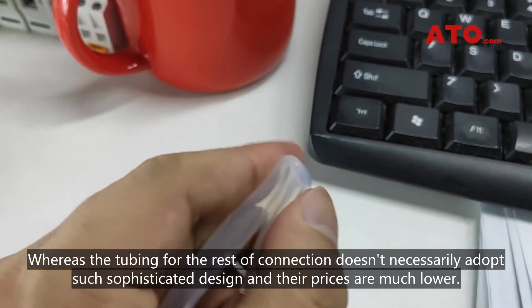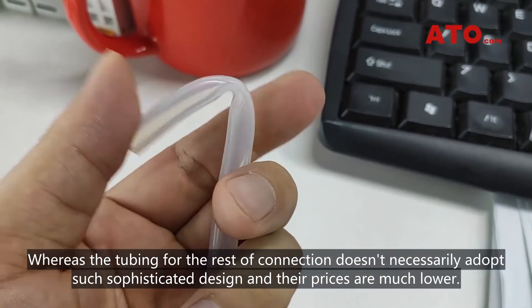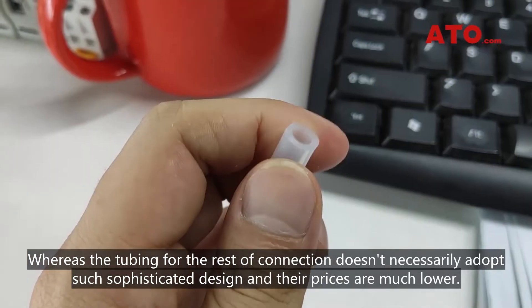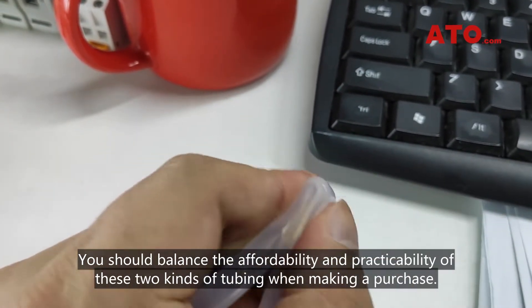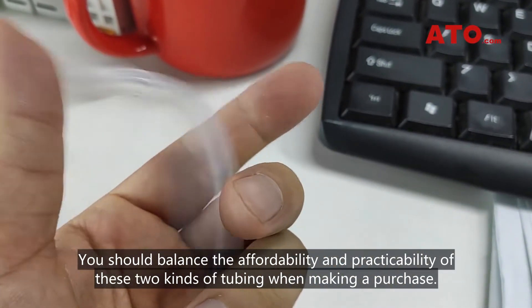Whereas the tubing for the rest of the collection doesn't necessarily adopt such sophisticated design, and their prices are much lower. You should balance the affordability and practicability of these two kinds of tubing when making a purchase.